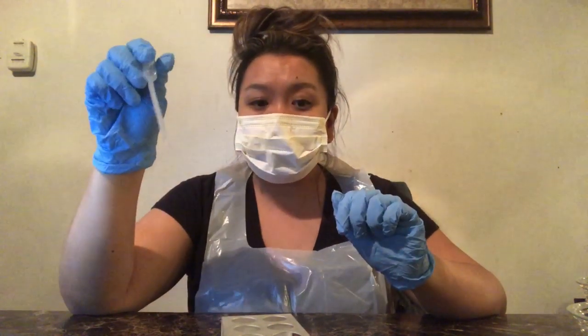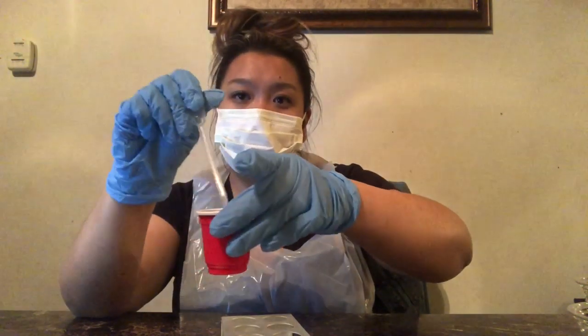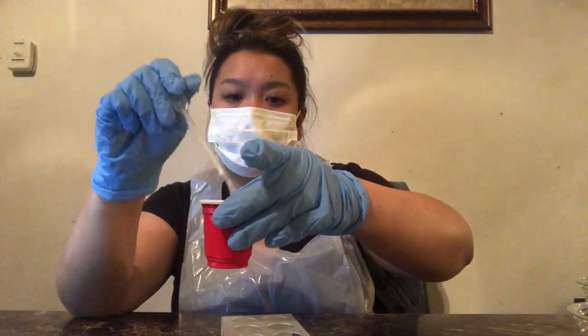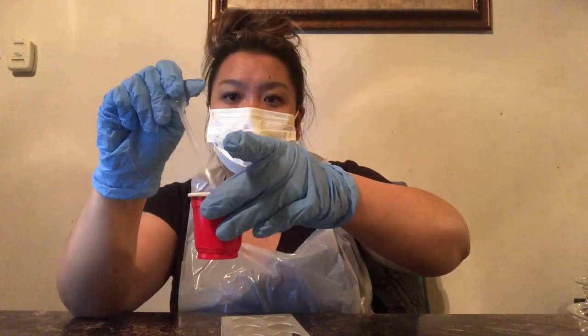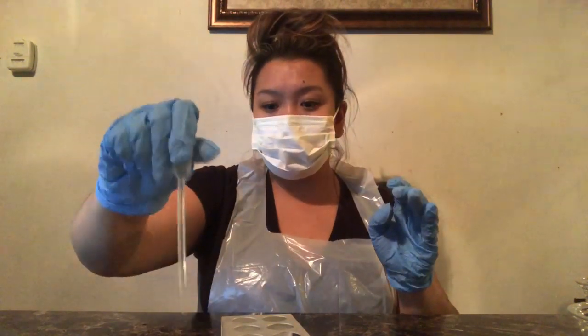So what I'm going to do first is ensure that my pipette is sterile and clean by dipping it into the alcohol and making sure it's clean and dry. So I'm just going to shake off the excess alcohol, set that down.